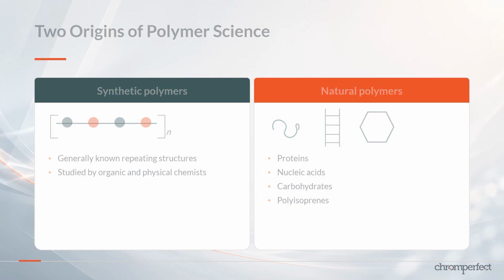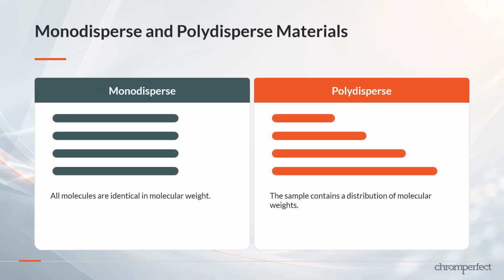When every molecule within a polymer sample is identical, the polymer is described as monodisperse. Pure proteins and nucleic acids may be considered examples of monodisperse polymers because their molecules normally have defined compositions and molecular weights. Many natural polymers and almost all synthetic polymers are polydisperse.